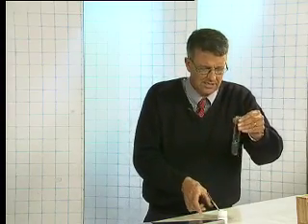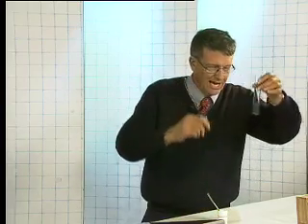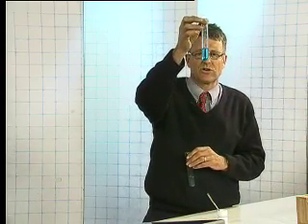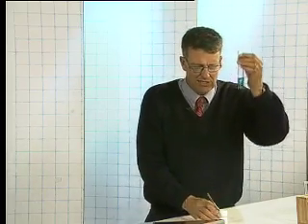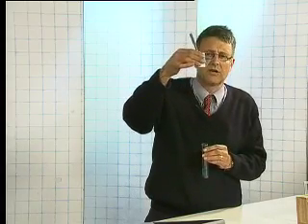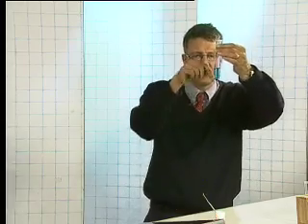I'm mixing them together and putting it down next to the other test tube. That test tube just has copper sulfate — you can see it's a lovely blue color. In this test tube I've added the iron powder into the copper sulfate.